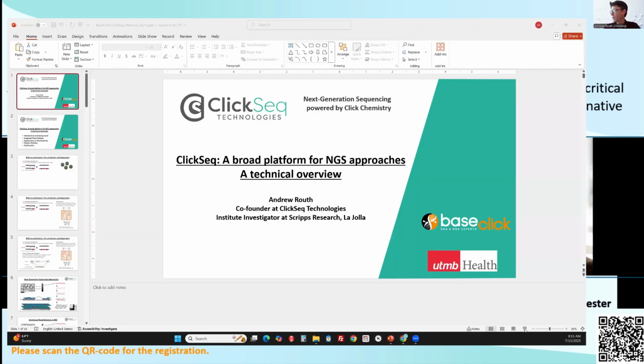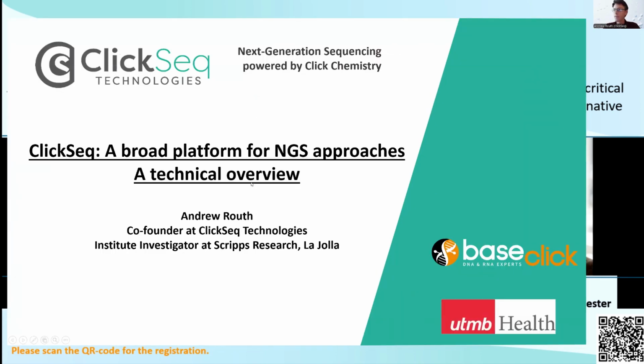Thank you very much for the introduction, Thomas, and it's a real pleasure to be able to present ClickSeq to you. I'm going to give a brief overview on some of the applications and technologies that we've developed using ClickSeq as a platform for next-generation sequencing.